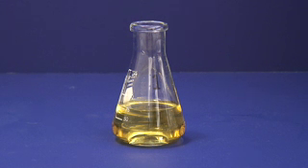According to our calculations, there should be some acetic acid left in flask 1. That means if we add more baking soda, we should see a reaction.